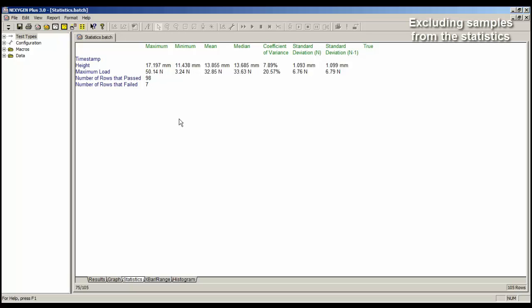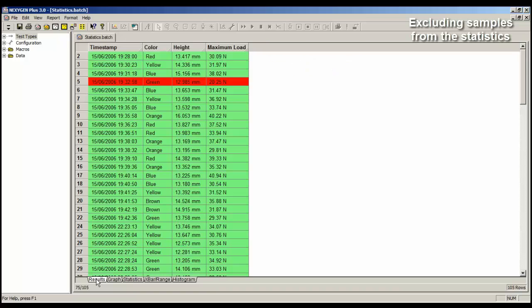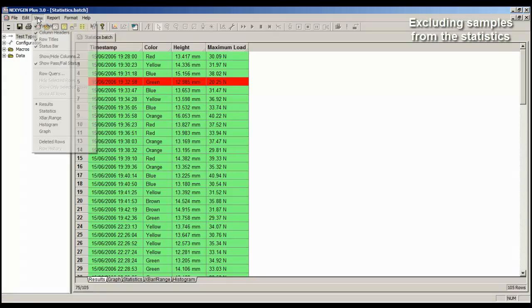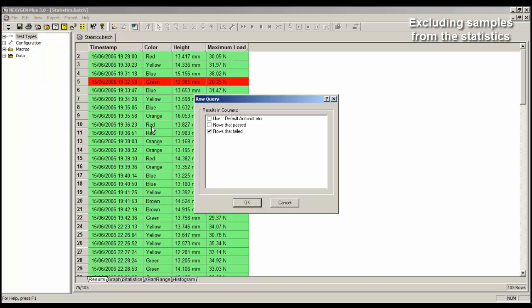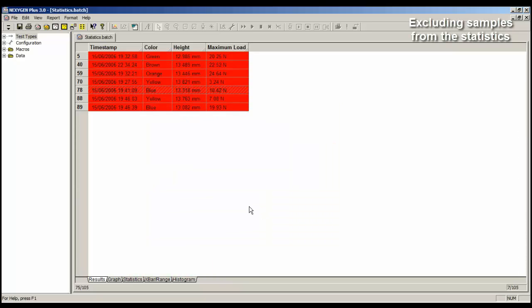So let's go back to the results table. We need to look at all of the failures, so we need to put the filter back on. So let's go view row query, rows that failed, OK. So there are the failures. Now I would like to exclude some of these.